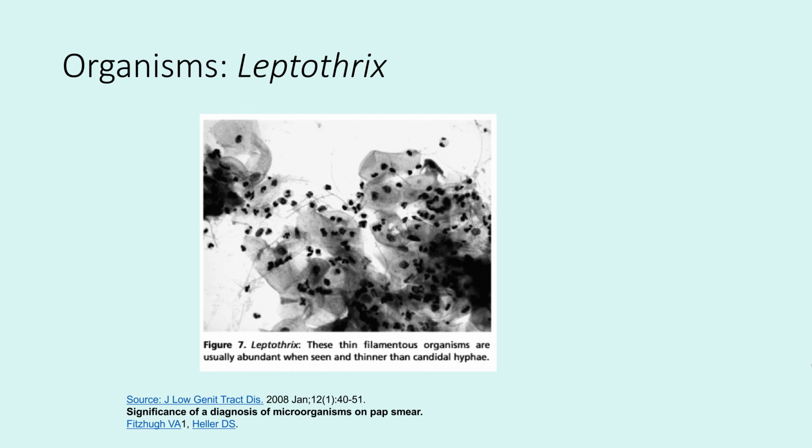squamous epithelium. And then this is an image of Leptothrix, which you can see in the background. They're those thin filamentous organisms, and don't mistake them for Candida hyphae.